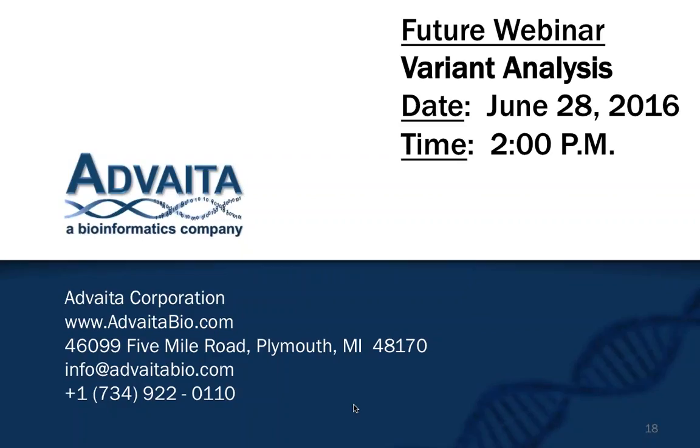Next comment or question: interesting webinar. Is it possible to integrate microRNA expression data in the presented analysis? I actually did not touch on microRNA expression in this webinar because I didn't want to jump from mRNA and protein to microRNAs, but at this time we do not accept microRNA data. We only accept mRNA and protein data in iPathway Guide. However, if in the near future we do decide to include microRNA data, this would be something that we'll definitely include in the meta-analysis portion.